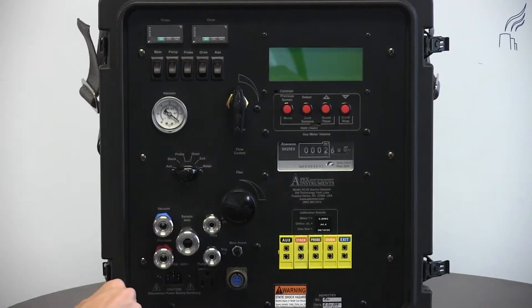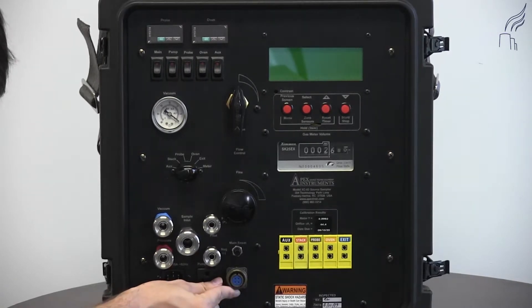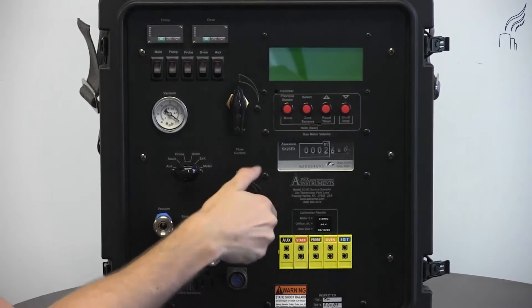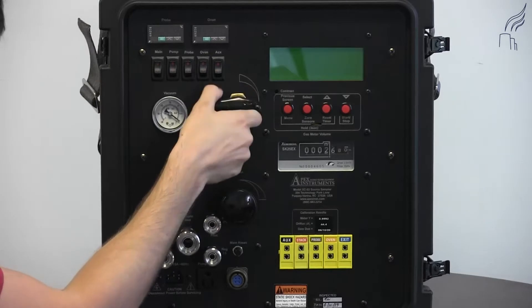Below our quick connects, we have our power supply inlet, our pump power supply, and industrial grade power connector. We also have a main reset switch, our fine flow control valve, and our coarse flow control valve.